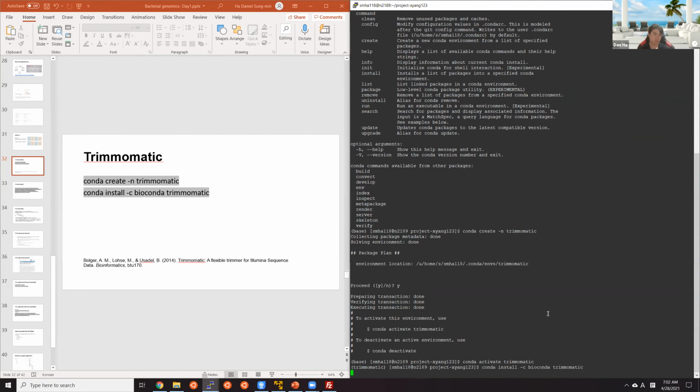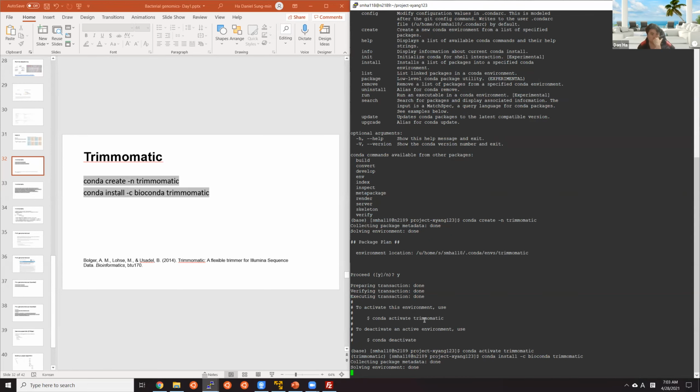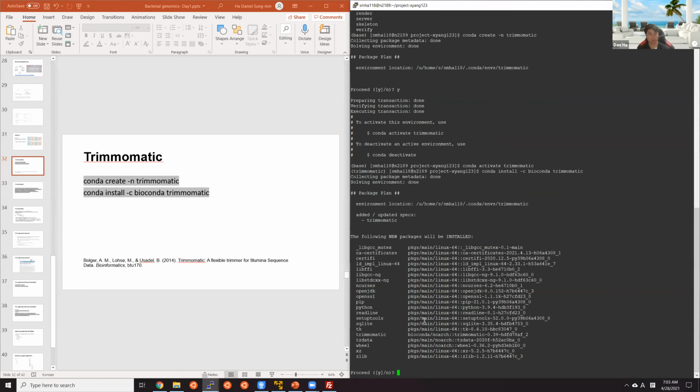And hit enter. It's gonna ask you to proceed.